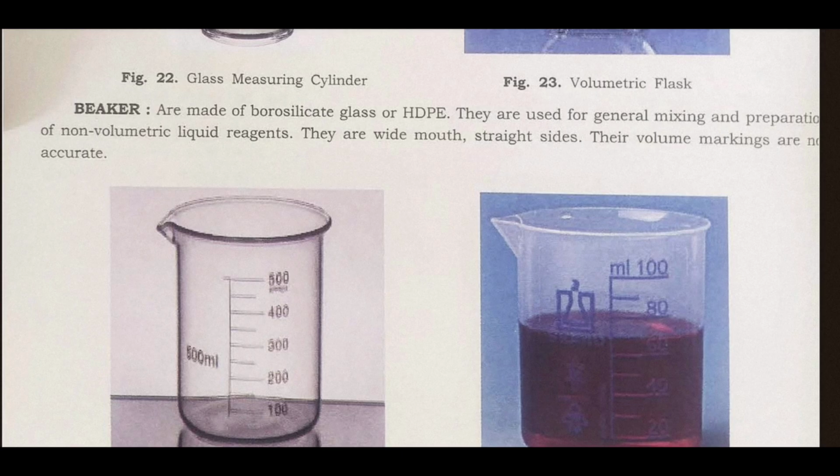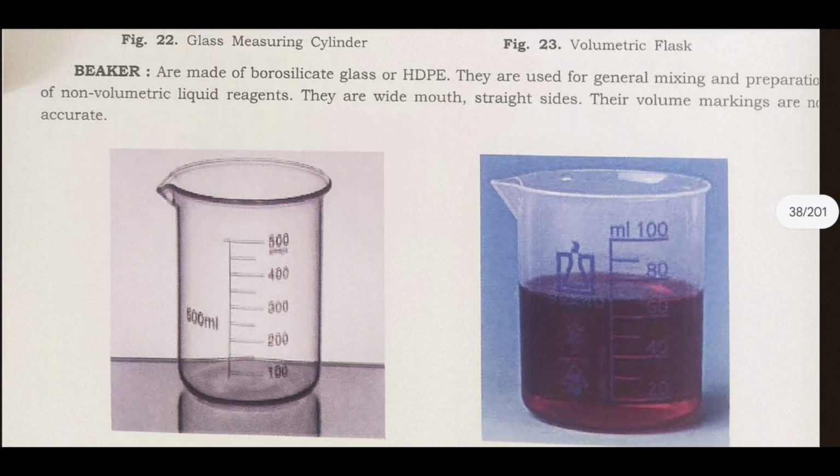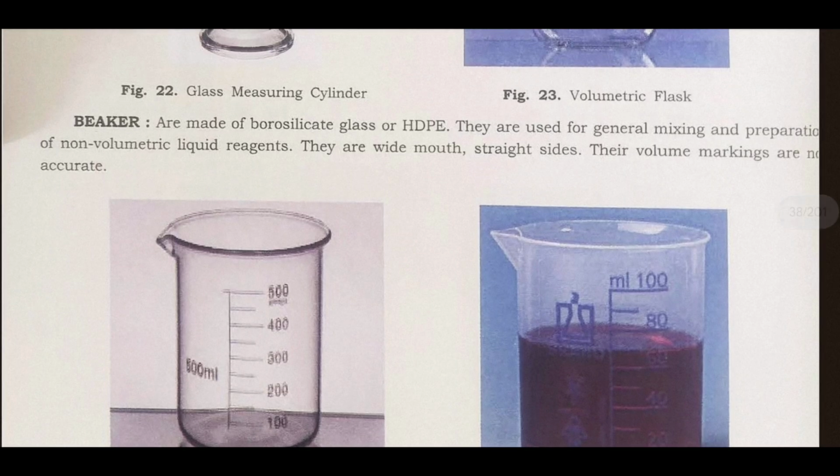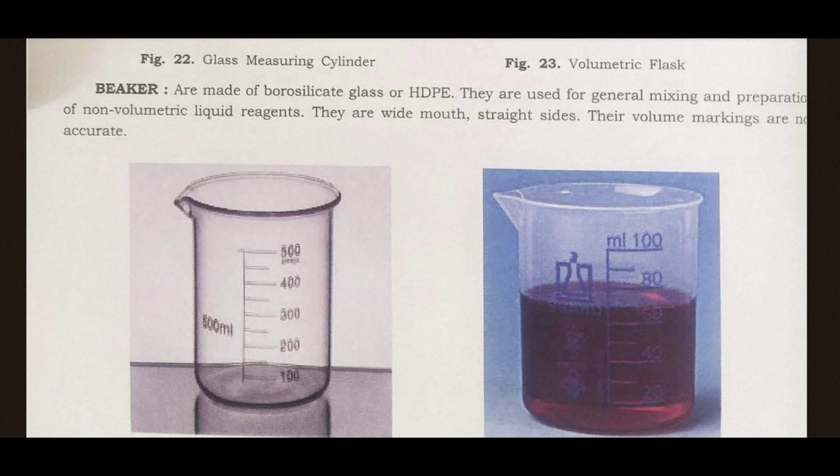They are used for general mixing and preparation of non-volumetric liquid reagents. They are wide mouth, straight sides. Their volume markings are not accurate.